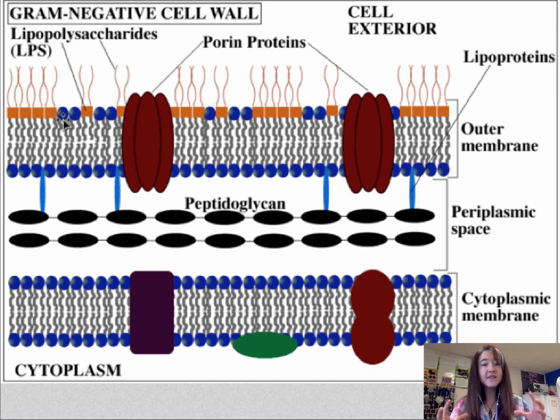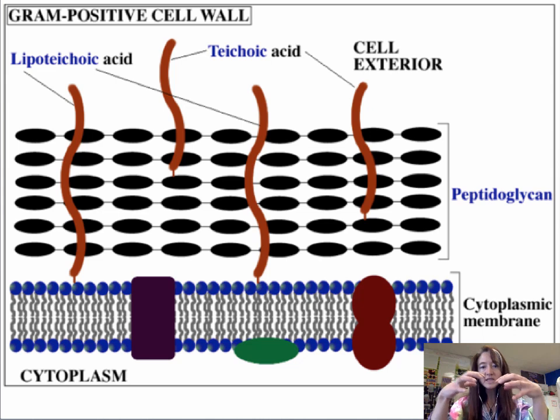The outer membrane is very protective. In fact, the outer membrane of a gram-negative prevents certain things such as antibiotics from getting to a gram-negative cell. However, interestingly, recognize that this is the kind of cell that loses the crystal violet dye. So let's talk about the gram stain mechanism, and then we can think about why it might be that the gram-negative cell loses the crystal violet dye, whereas the gram-positive cell holds tight to that crystal violet dye.